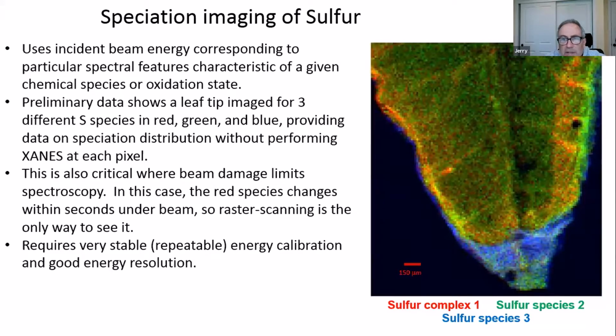Another question is, for example, this scan of the meteorite sections, how long does this kind of an XRF map take to do? The larger maps that I showed were typically 4 to 8 hours. The smaller, finer maps were 1 to 2 hours. Even though they're a finer scale, they were a much smaller area. We've done a few overnight maps too.